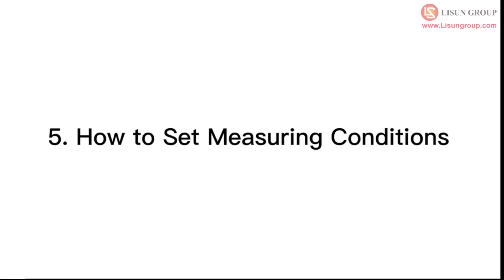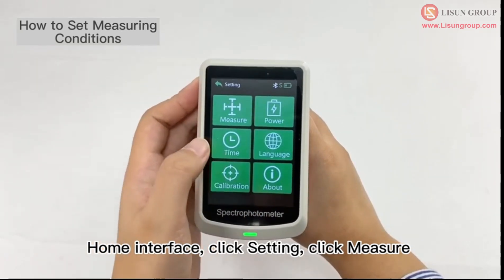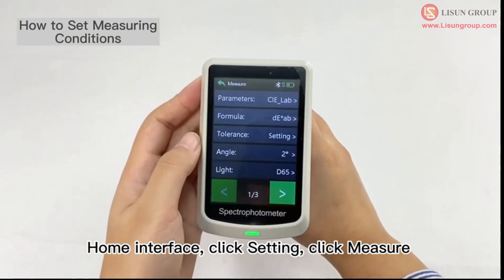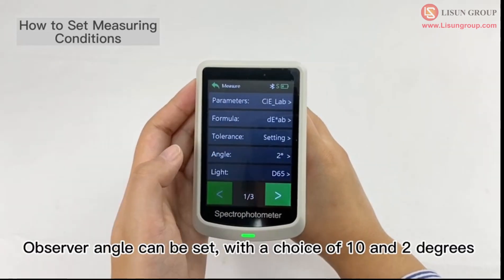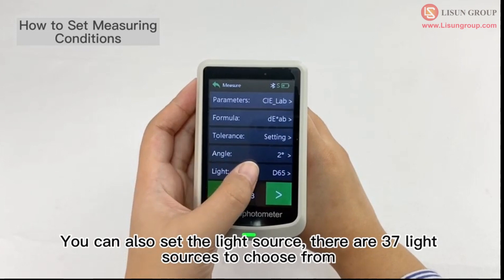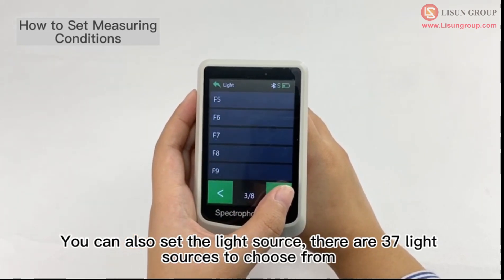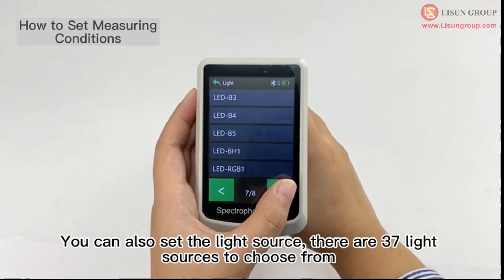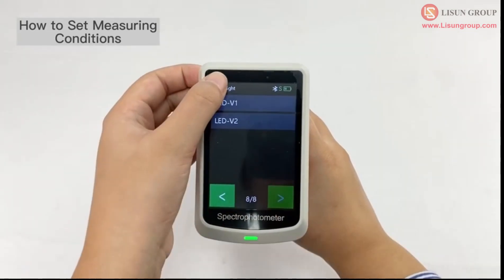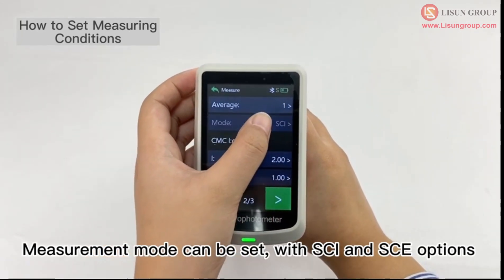How to set measuring conditions. From the home interface, click setting, then click measure. Observer angle can be set with a choice of 10 and 2 degrees. You can also set the light source — there are 37 light sources to choose from. Measurement mode can also be set, with SCI and SCE options.